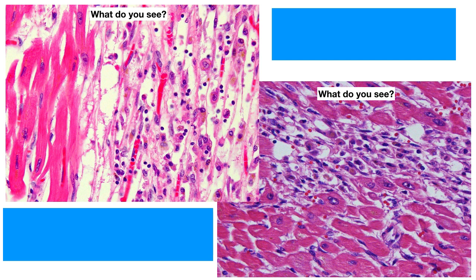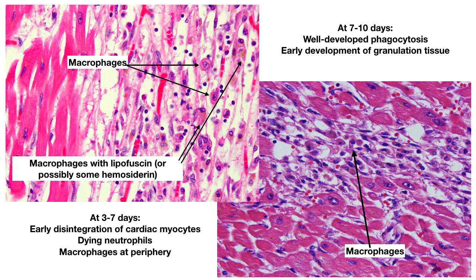On the left side, the dead cardiac myocytes have all been cleaned up. The neutrophils are basically gone, and what you see are macrophages that have come in and engulfed everything. Within them, you can see some finely granular yellow pigment — likely lipofuscin from the dead cardiac myocytes, though there could also be some hemosiderin if there was hemorrhage associated with the infarct. On the right, you can also see macrophages. At 3 to 7 days, you see early disintegration of cardiac myocytes, dying neutrophils, and macrophages at the periphery. At 7 to 10 days, there is well-developed phagocytosis and early development of granulation tissue. Both images show macrophages but no well-developed granulation tissue, so this is around seven days — somewhere in between, as it is a spectrum.